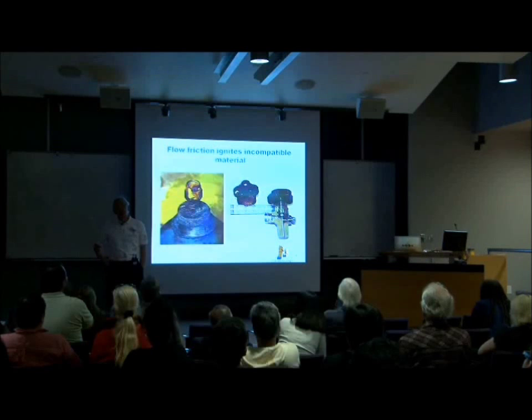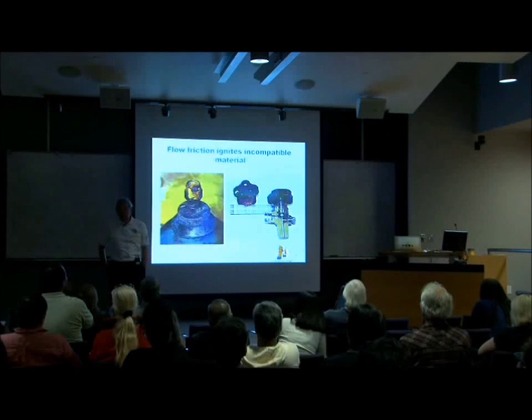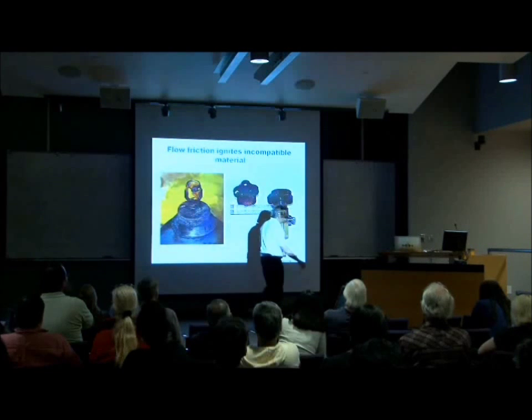If you want to control your gas flow, use a flow meter or use a needle valve further downstream. Your cylinder valve is your primary safeguard. If something happens, you need to be able to close that valve, right? You should never be using the cylinder valve as your control device.